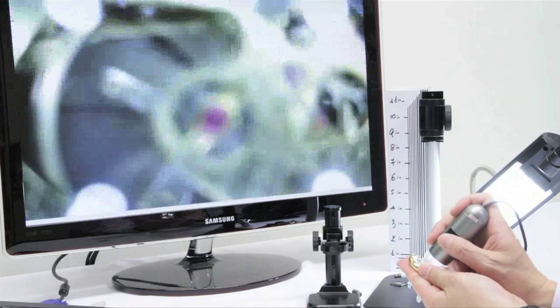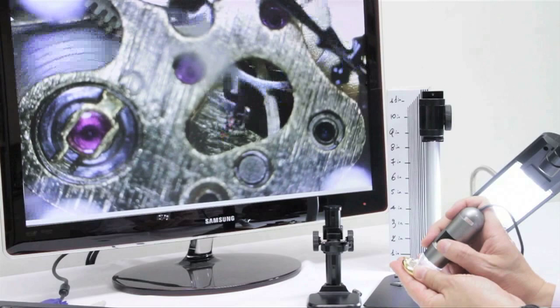You can take still images as well as video and time-lapse video with this camera.